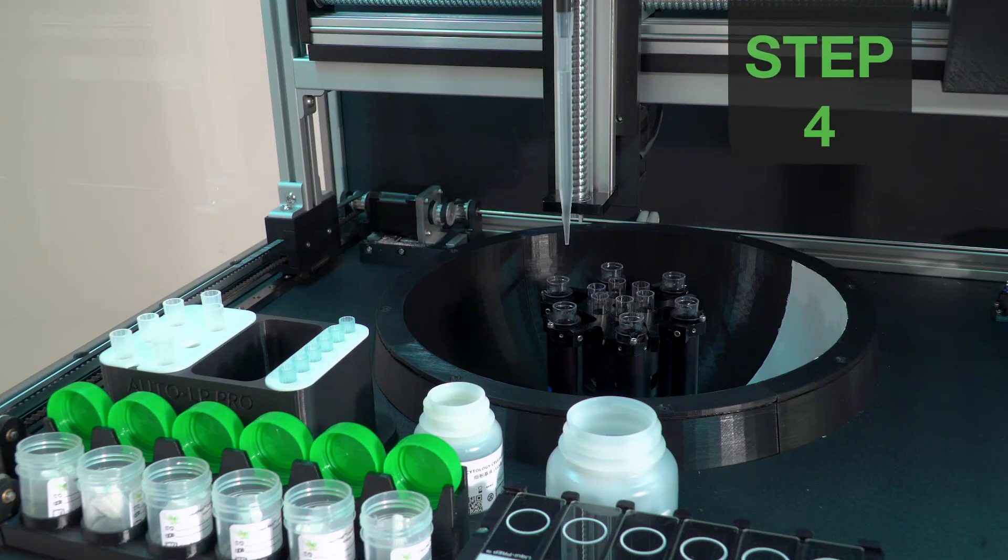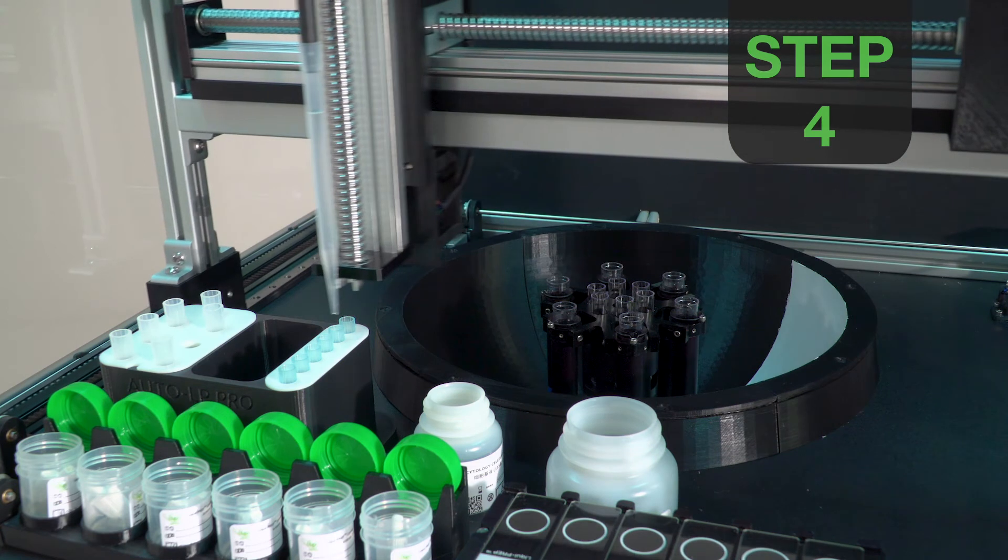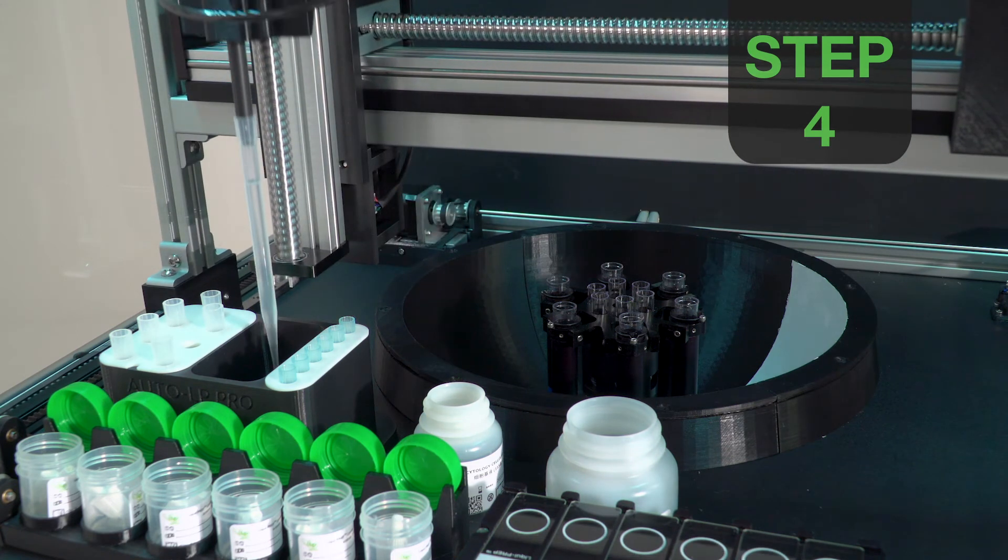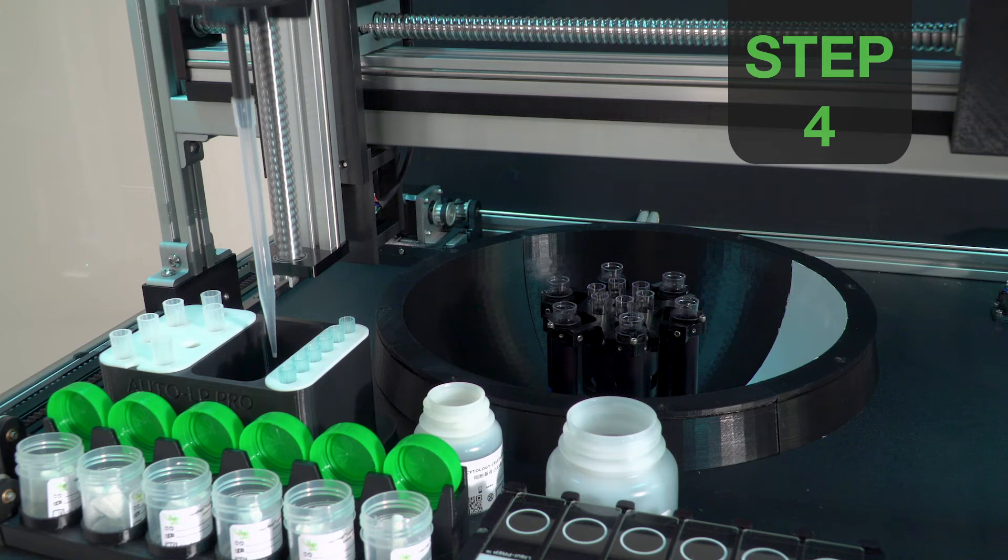Using the corresponding 5 milliliter pipette tip for each specific specimen, approximately 4.5 milliliters of diluent is removed from each centrifuge tube.